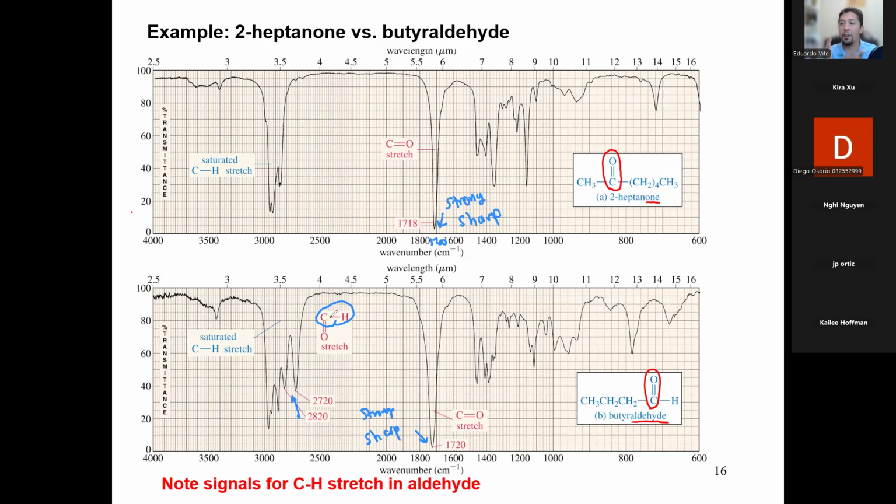And how do I know that it's a carbon-hydrogen? Because look at the rest of the group. These are the stalagmites, right? Stalagmites, stalagmites, yeah, because it's ceiling. These are the stalagmites that I told you about, the CH stretches. Notice how this CH stretch is also in the similar region. That's how you know it's a CH stretch. If it was CO, it would be over here with the carbon oxygens.